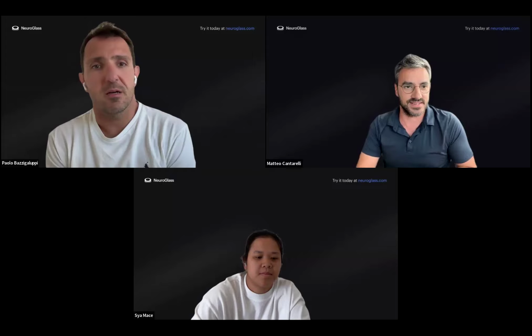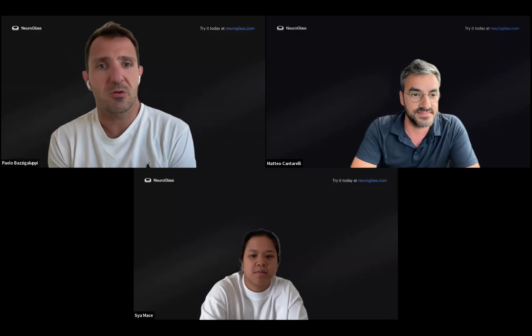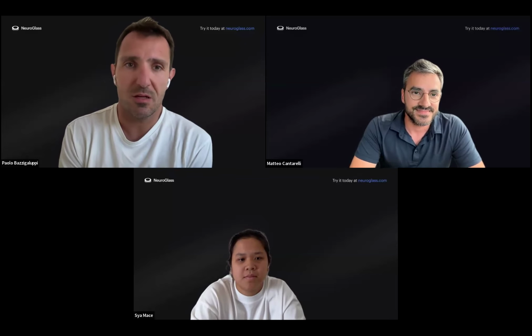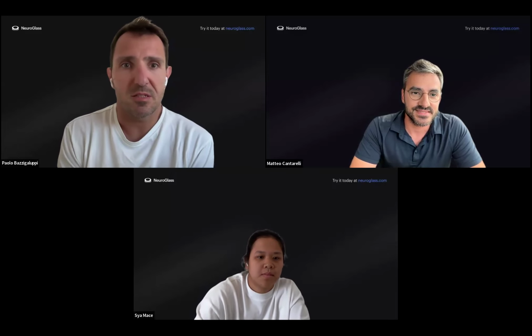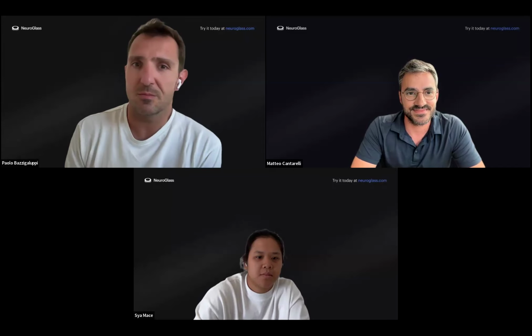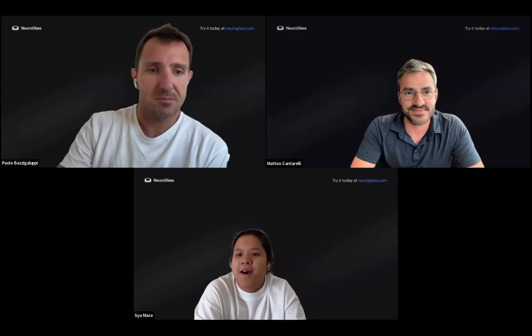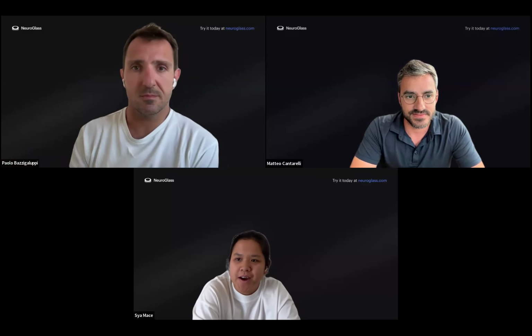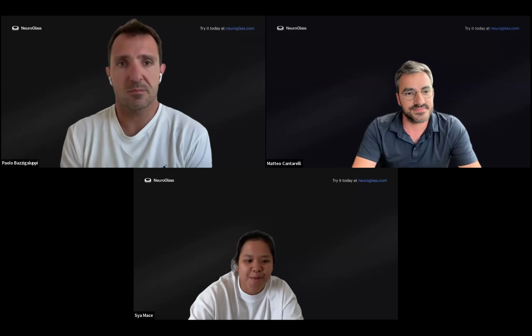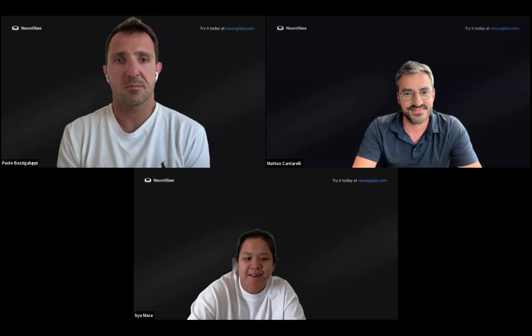Sure. Thank you, Matteo. Nice to see everyone. My name is Paolo. I'm a director of R&D at MetaCell, and very excited to be here with you today and take you through what NeuroGlass does today and what's going to happen tomorrow. Saya? Hi everyone. Thanks for joining. I'm Saya. I'm the design lead working on NeuroGlass. I'm based in London. I'm excited to share what we have in the works here.